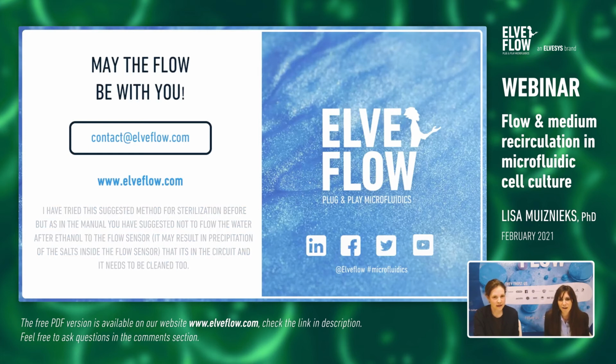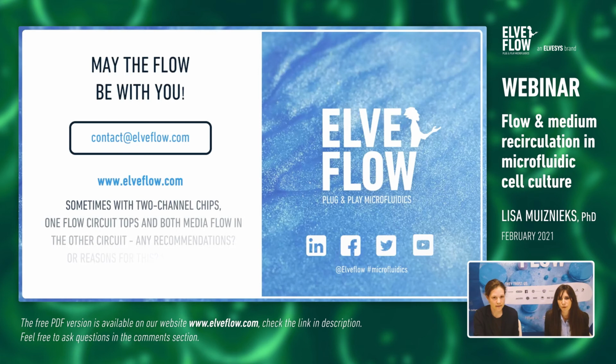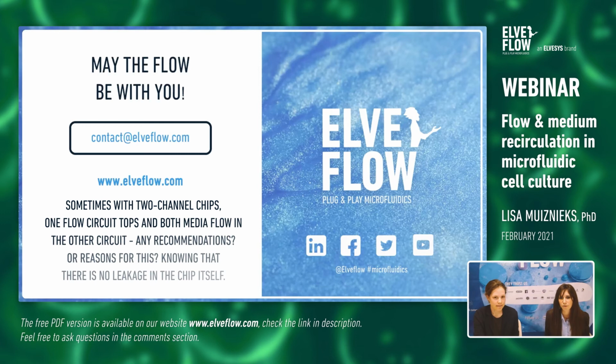Another question from Agar, similar to the problem mentioned above: sometimes with two-channel chips, one flow circuit stops and both media flow in the other circuit. Any recommendations, knowing that there is no leakage in the chip itself? It sounds like there might be.